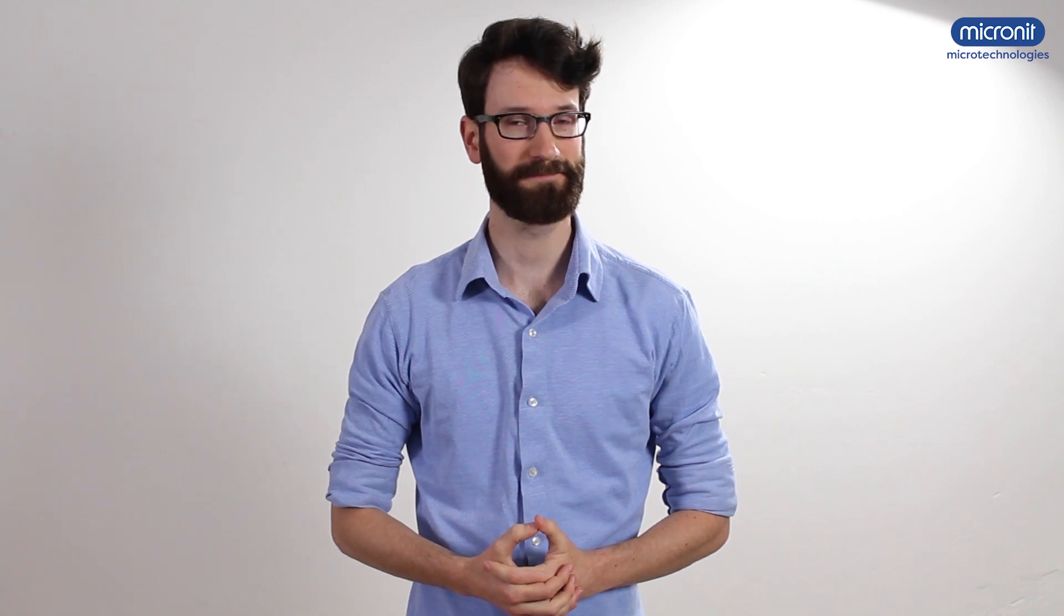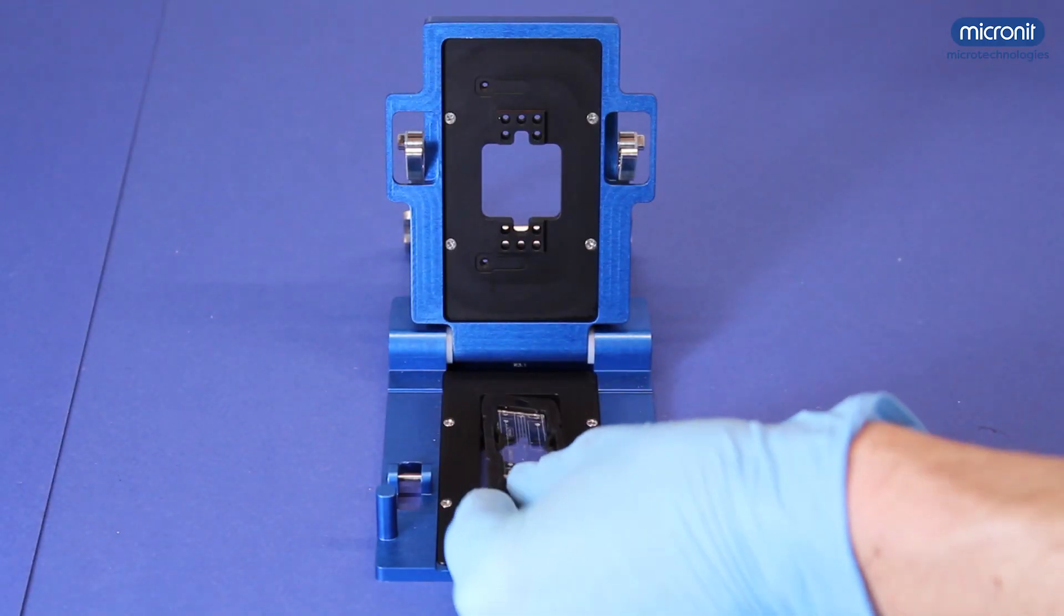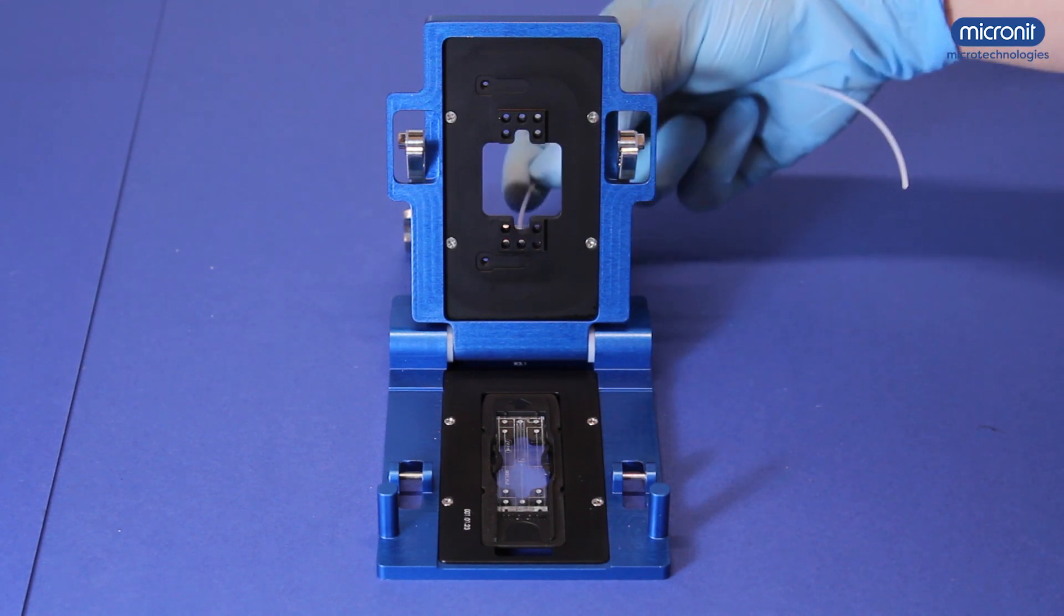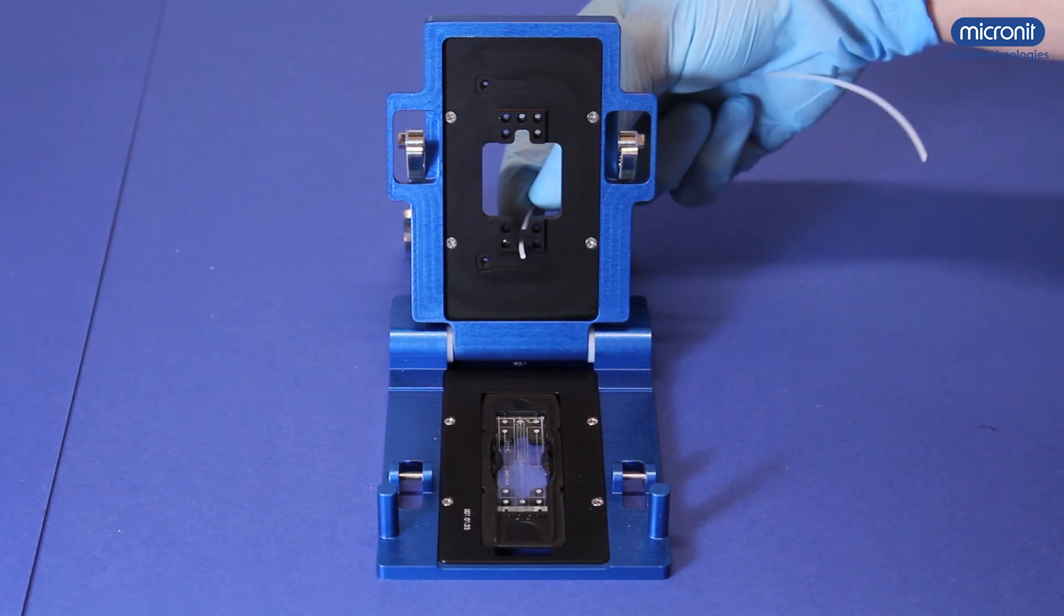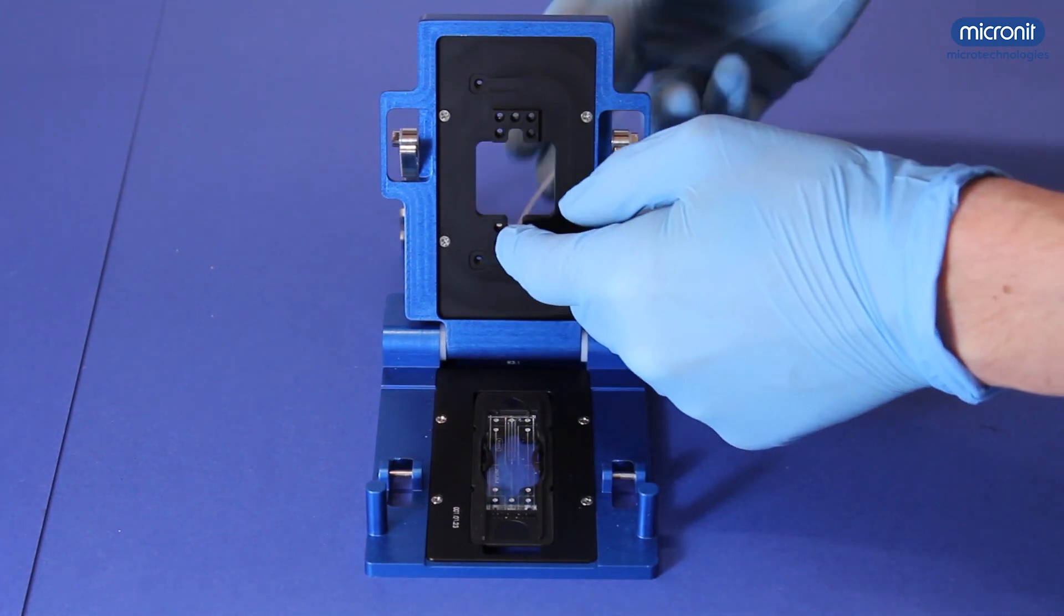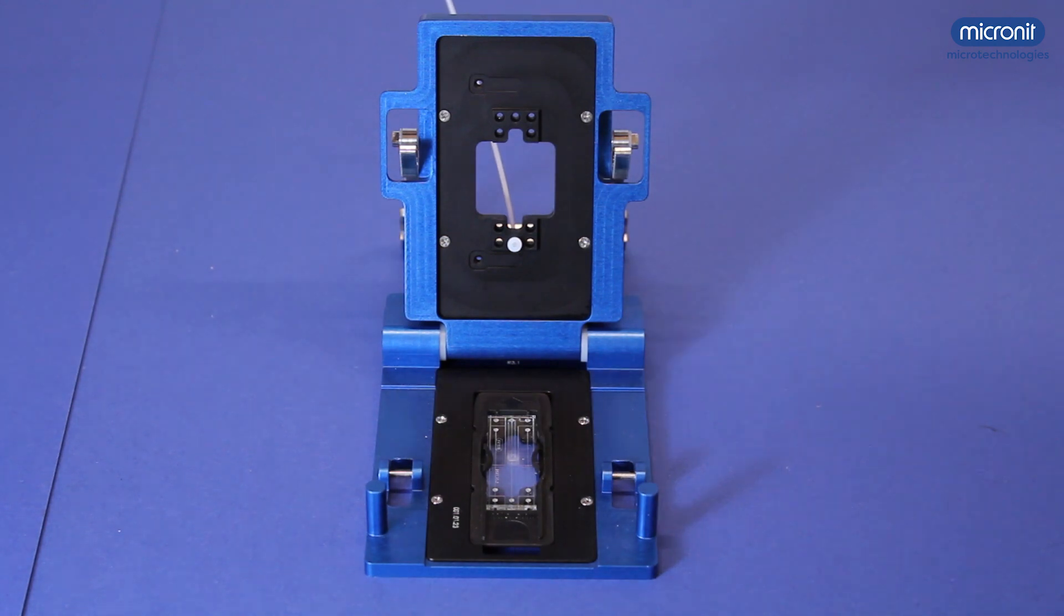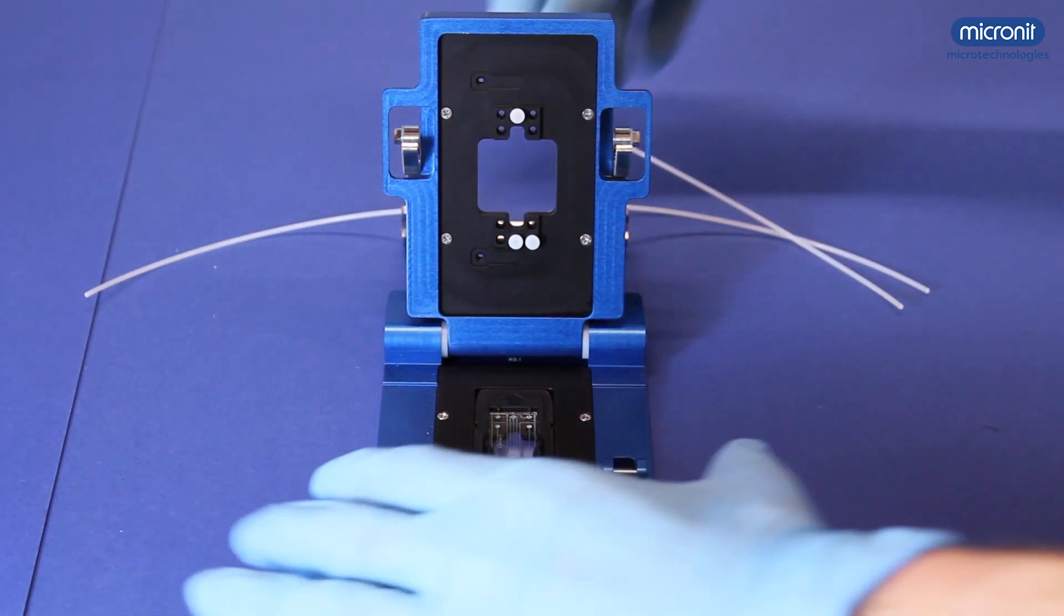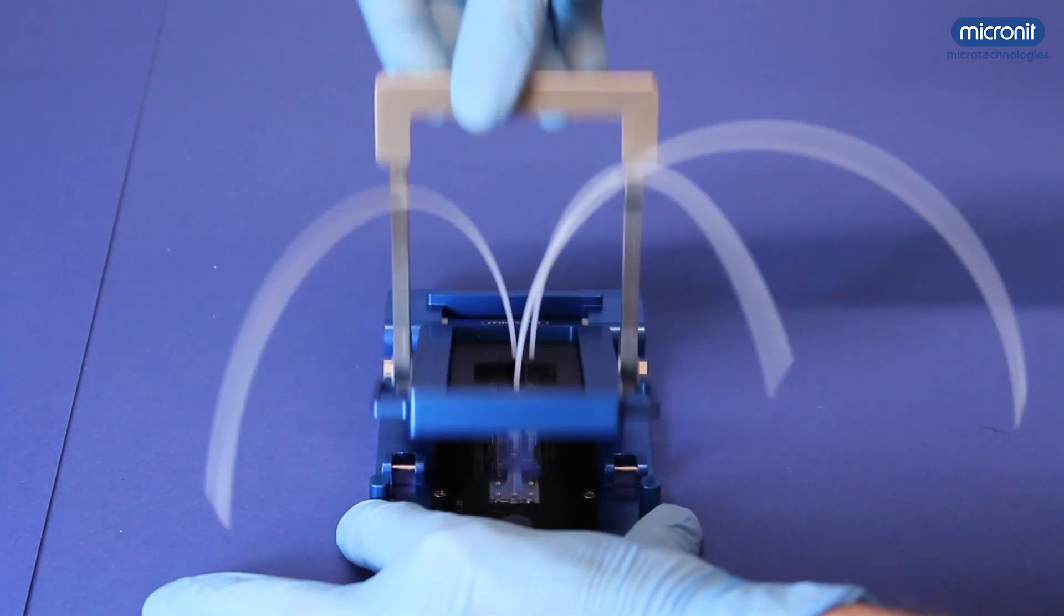There are many different kinds of droplet generators. Make sure you check which holes should be connected for your specific chip. Now place the chip in the chip holder and connect the tubing to the right holes. Place a ferrule on the tubing. Close the chip holder and the tubing is sealed to the chip.